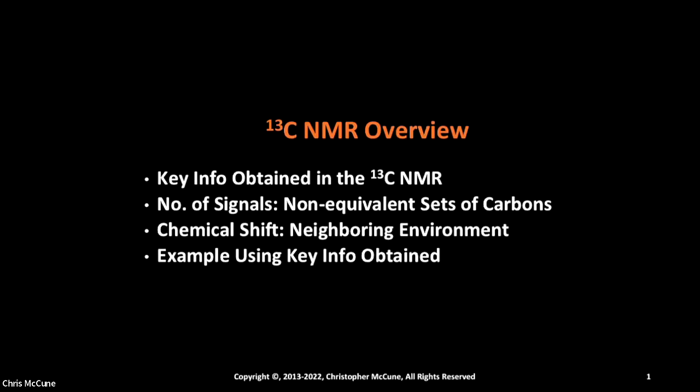And I'll go over a couple of examples that use these key pieces of information to try to determine what structure is most appropriate for the carbon-13 NMR shown. I have two problems that I will go over.